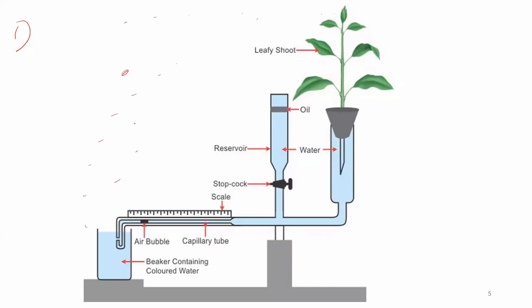Why? This setup should be put into the water to remove all the air bubbles.